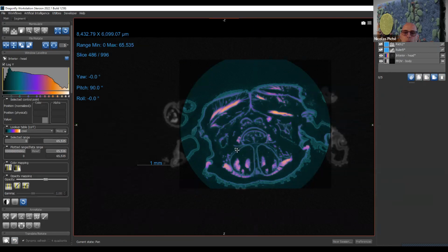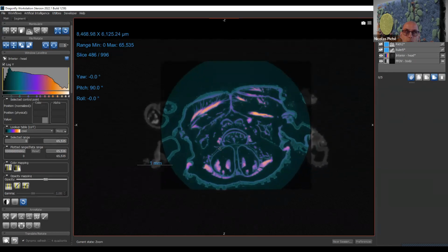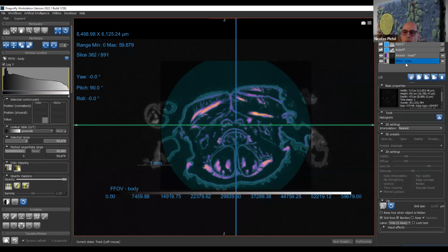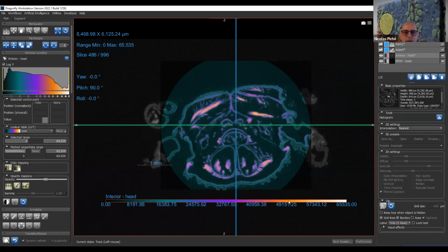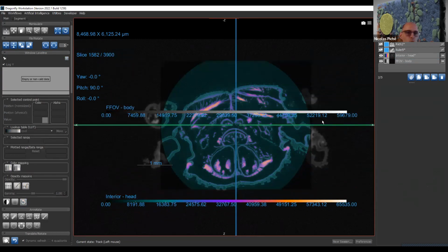Okay, so what I was about to say, sorry: when you select the object, the feature that comes with it is shown on screen. So here you see the legend for the wide field of view. This is the legend, the lookup table, and the values for the head. And if I select both, you should see both. If you have 10 data sets, you can show all of them. You can switch them for vertical, horizontal, and stuff like that. So you can prepare a picture that is quite pretty. Press on the button, and you have what you need.